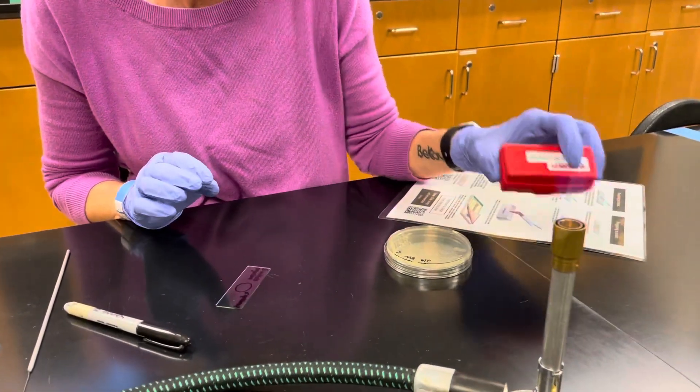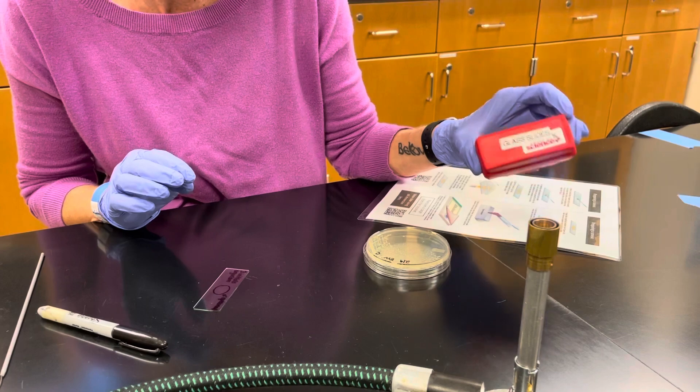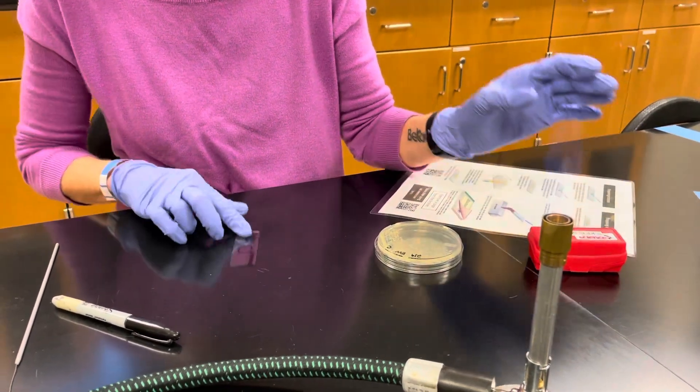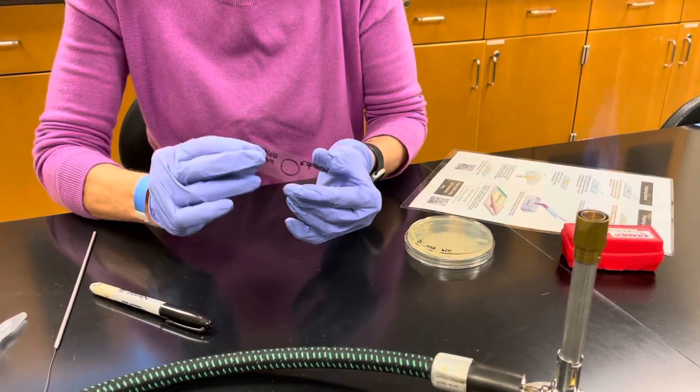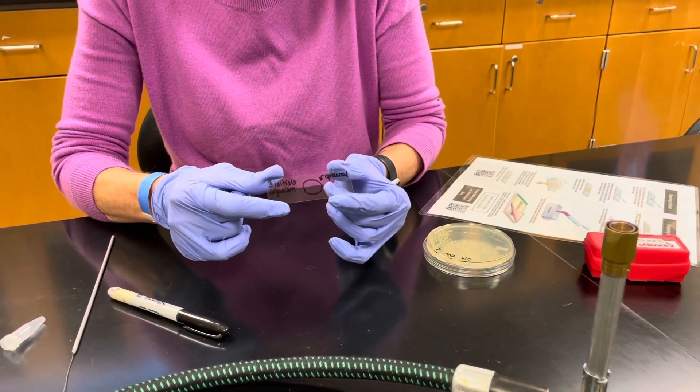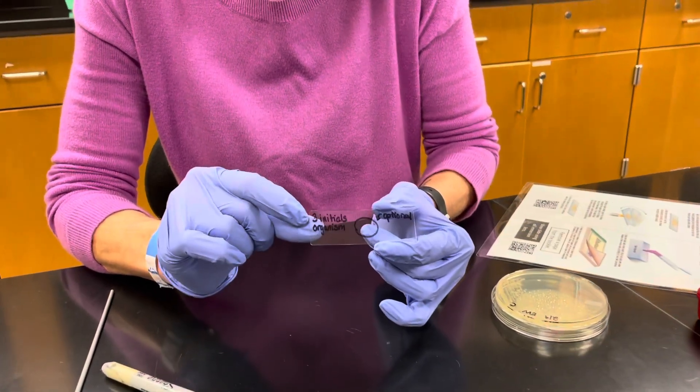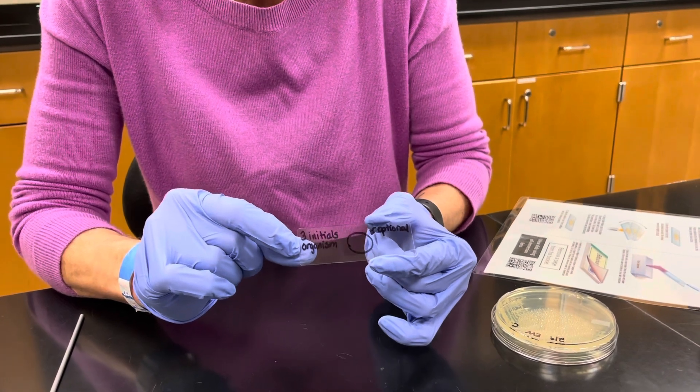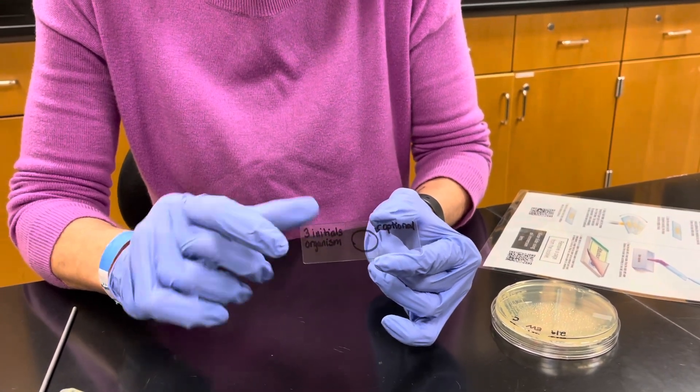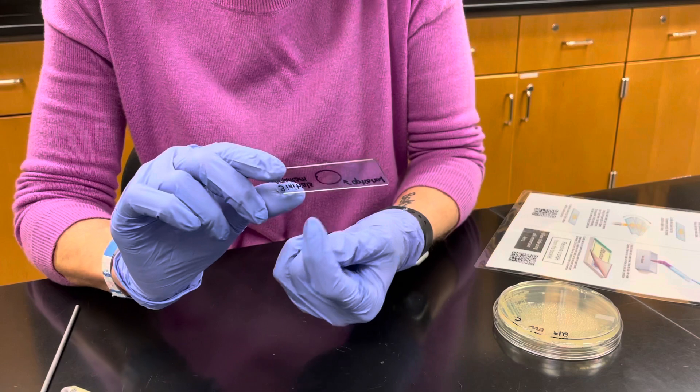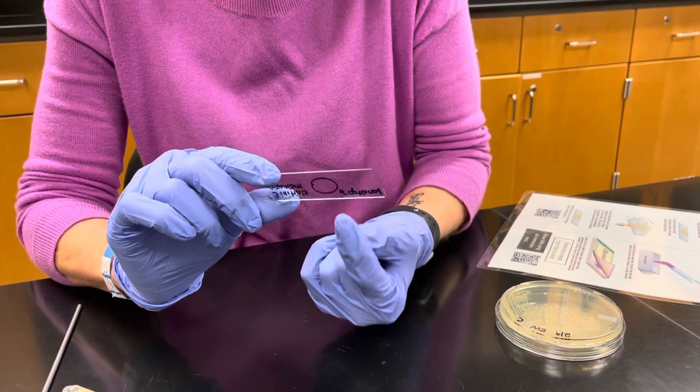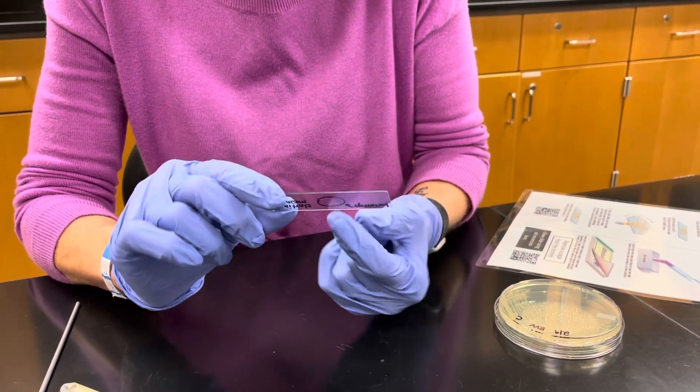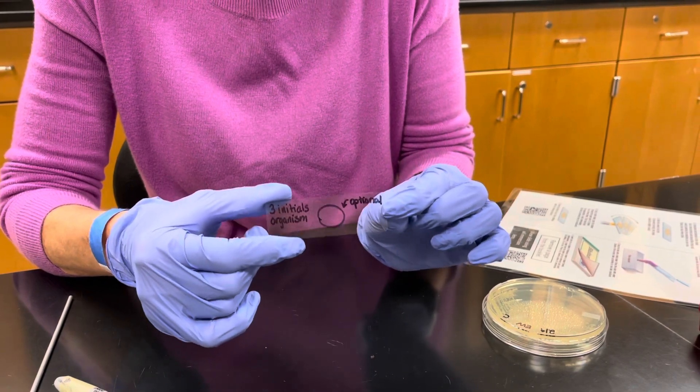First thing you need is a clean glass slide. You should have one in your slide box. You need to label your glass slide. Whenever you're doing staining on the left-hand side of the slide, you want to put your three initials, the name of your organism or the letter of the plate that you're taking your specimen from, and then if you want, you can put a small one centimeter circle on the back of the slide just to help you find where your smear is located.